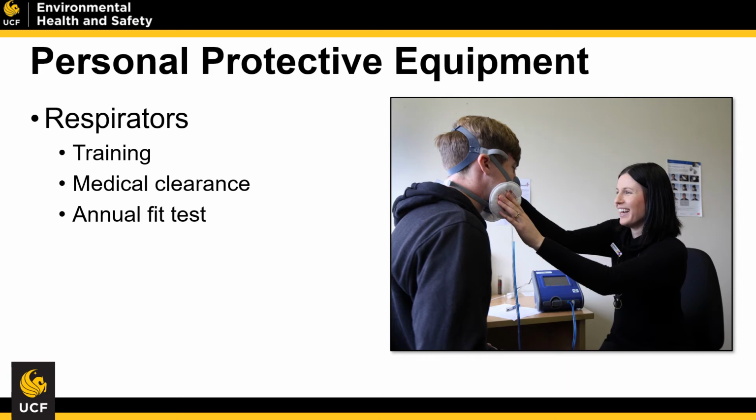Special training will include your online training, a medical clearance with a health professional, and then we'll have an actual fit test that's done annually to make sure that the mask is being properly worn. If you're not medically fit to wear a respirator, it could cause increased heart rate and exhaustion of your cardiovascular system, which could lead to medical complications. We don't want that to happen, so we want to make sure that you're fit enough to wear it by asking you to perform additional testing to do so.